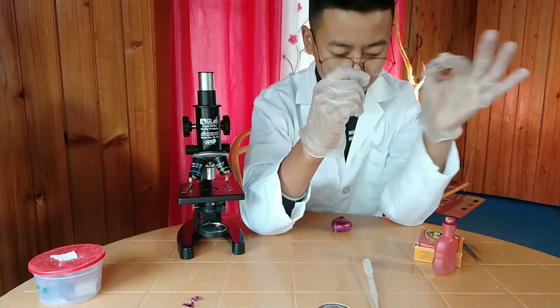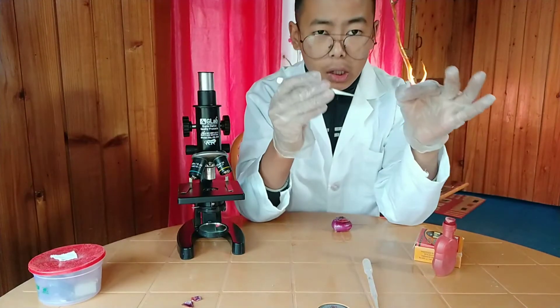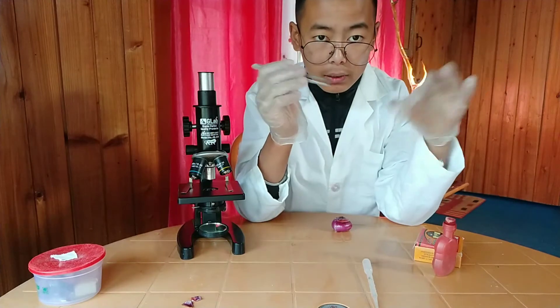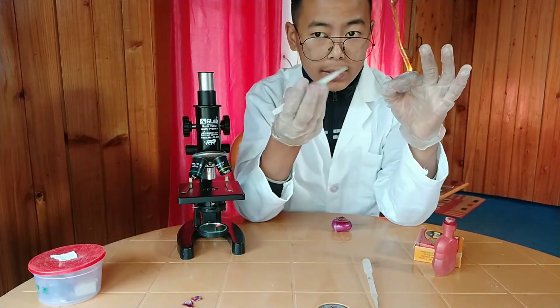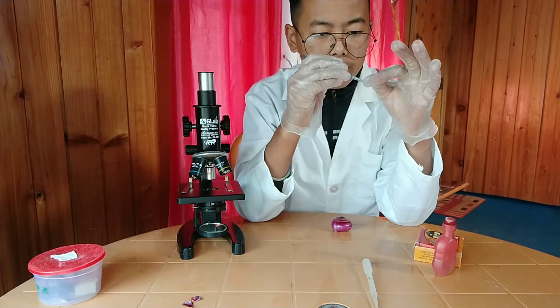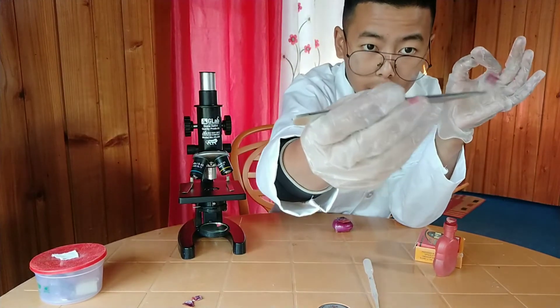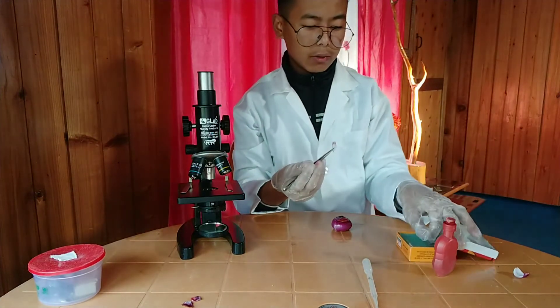The epidermis or membrane is situated in the inner part, so we have to separate it. You must have seen while cooking in the kitchen that white thin part of an onion which is present inside — that is the thing we're going to need. You have to tear it or separate it with a tweezer. Look, I've got it.